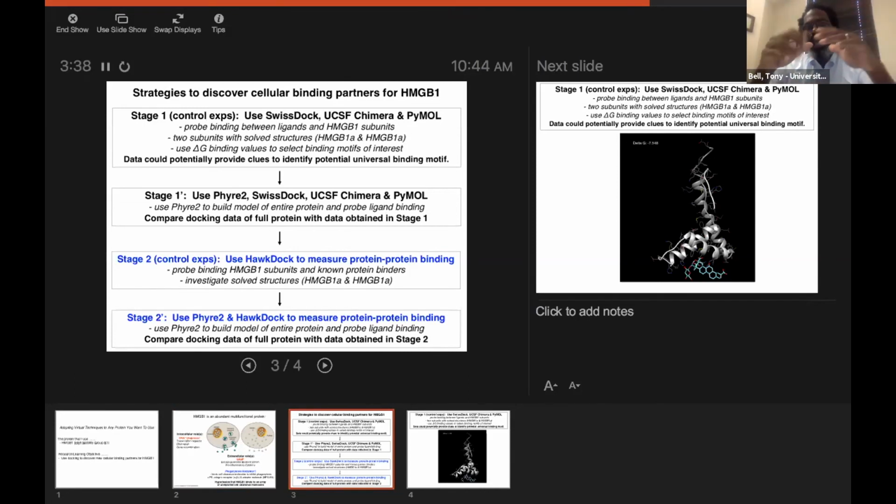The one caveat about UCSF Chimera is that you have to use the free files that you get from SwissDock within about a week, or they magically go away. We found this out the hard way in class, so find all your poses and do everything you want in Chimera, and then you can go back later and work in PyMOL as long as you want.